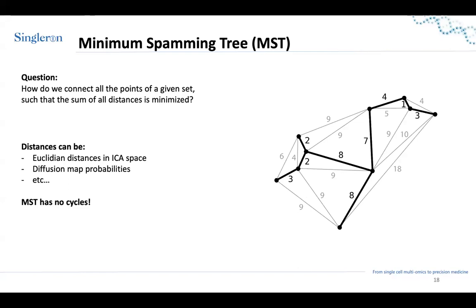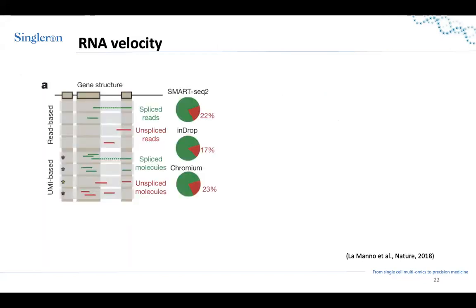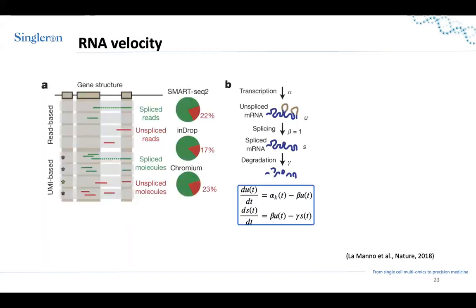Let's jump back to the velocity topic. So the question is on the single cell velocity and the read depth. So if some genes have shallow sequences, will they work well with the single cell velocity, or how does the sequencing depth affect it? No, it will not work well.